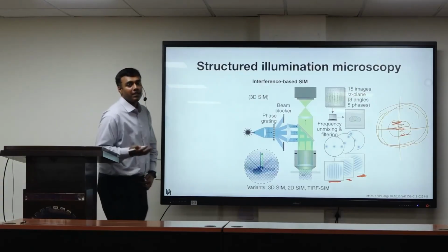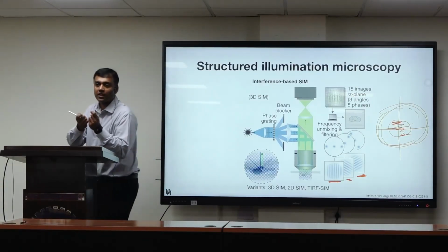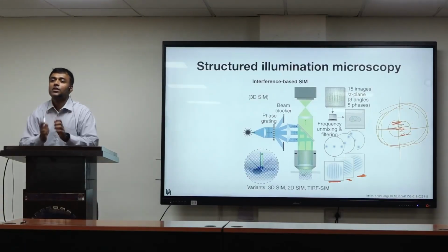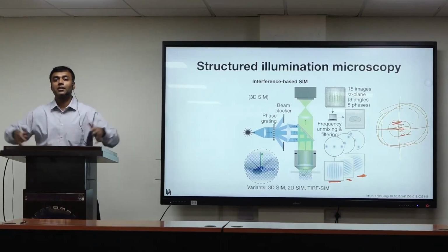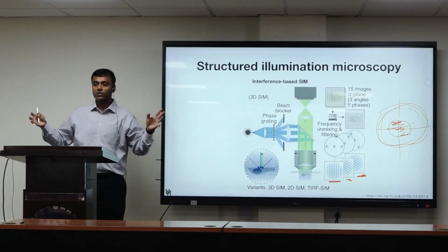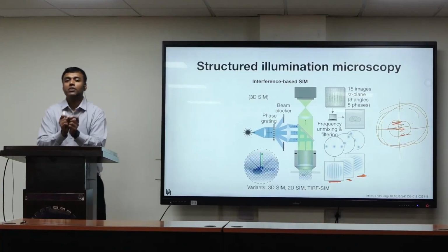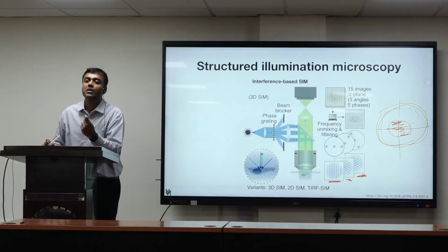So what does that mean? If you add a lot of higher frequencies, you'll get a sharper image, right? You'll get better edges. The higher frequencies that you can use, the sharper your edge will be, the sharper your image will be. In other words, it becomes better resolution, smaller resolution.